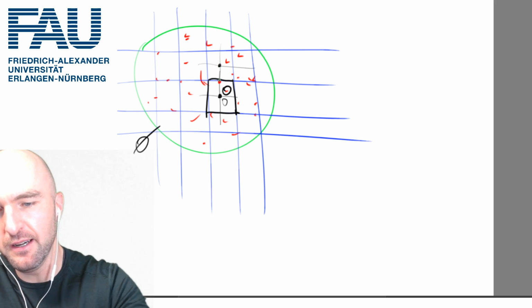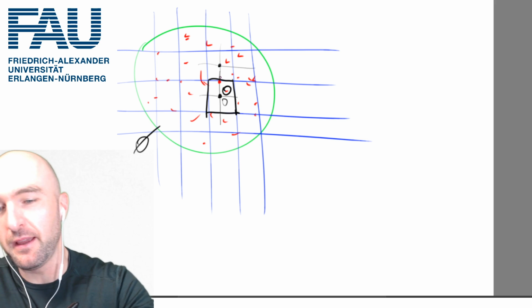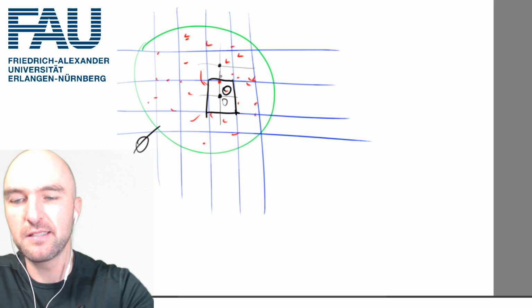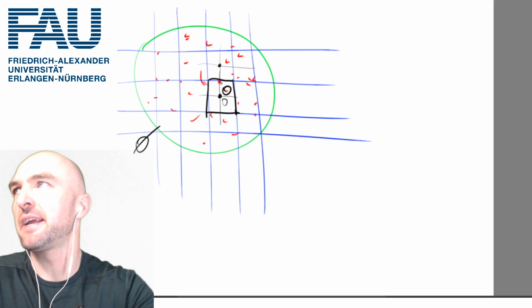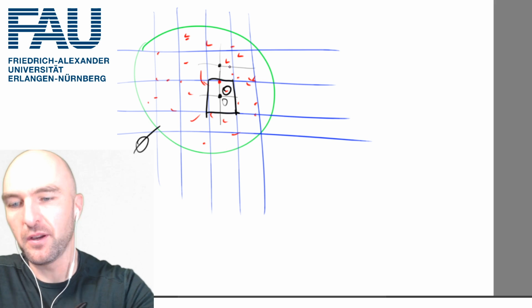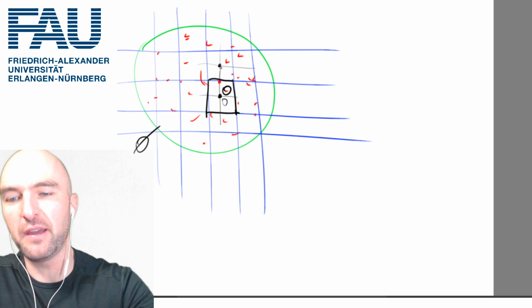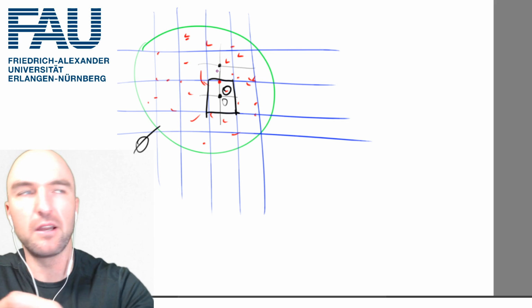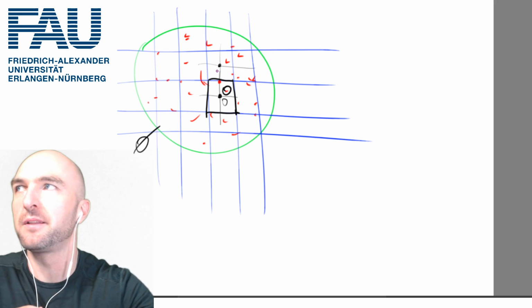And this thing here would then legitimately probably be half here and half here. And this is something that we actually haven't accounted for in this case. Because yes, especially if you have relatively low statistics, it makes the results dependent on the location of the grid.